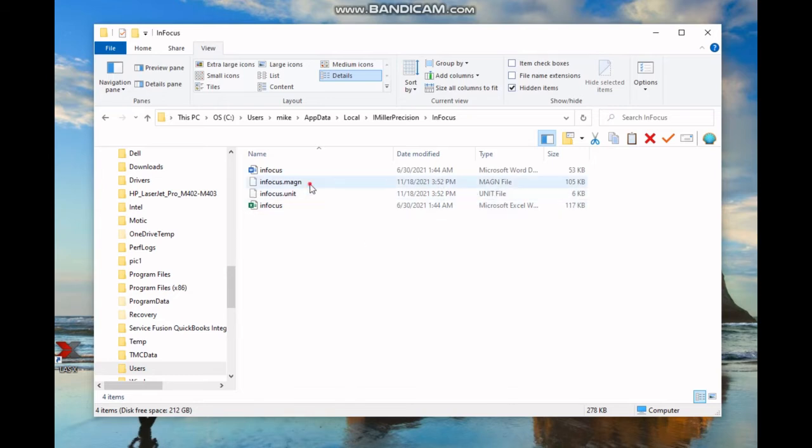So what we want to do here is right-click and copy that file, or probably save that to a USB stick or a thumb drive, or put that into a public shared drive so that other people can access it. Putting into a shared drive is probably the easiest thing. That way each user can simply do that on their own time as they log in. You simply copy this file, then you'll go back to the same file path, just simply under a different user, and paste this file or copy or transfer this file into said folder.